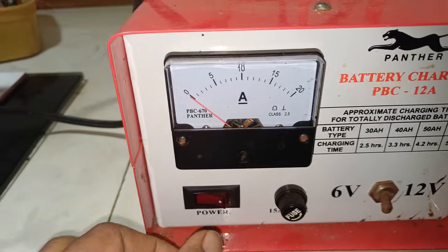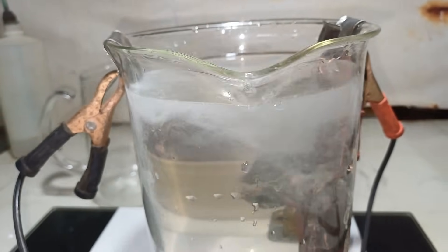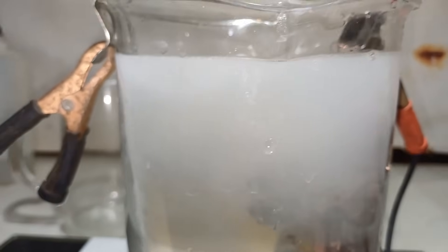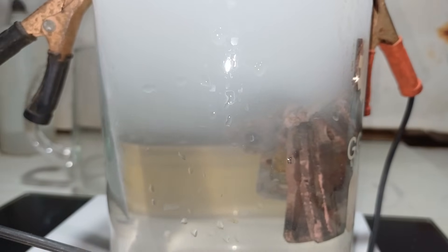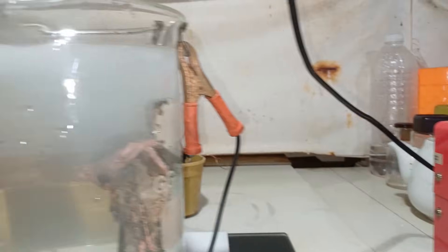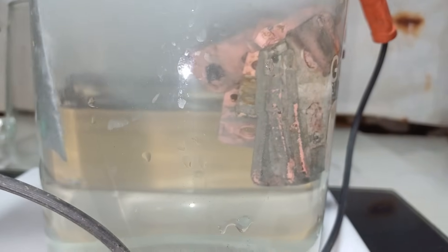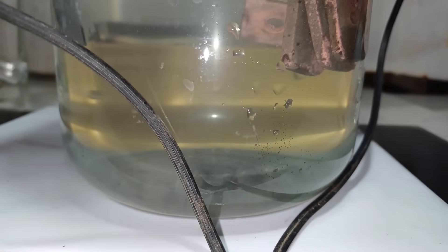We started at 6 volts and turned on our battery charger. We're running at 5 amperes. I can see some plating falling down at the bottom of our beaker. We'll wait a few minutes and observe the voltage. Our beaker is remaining cold and as we can see, some plating is falling down to the bottom.